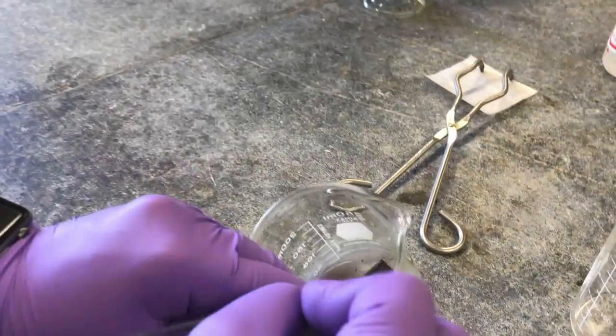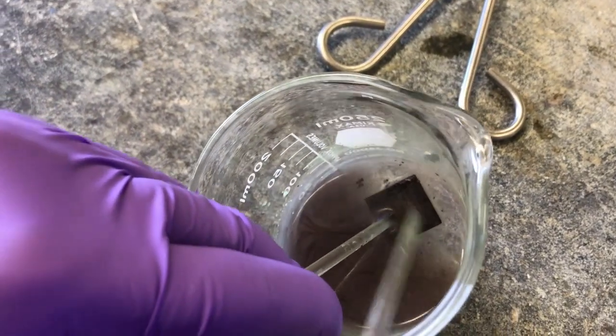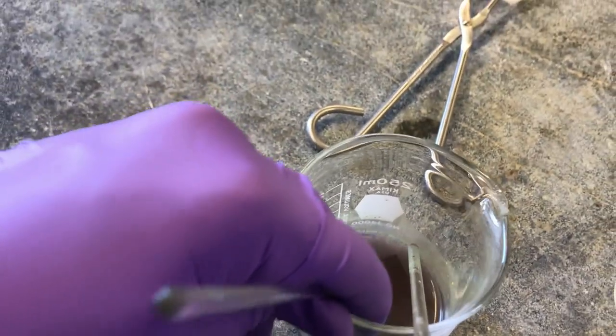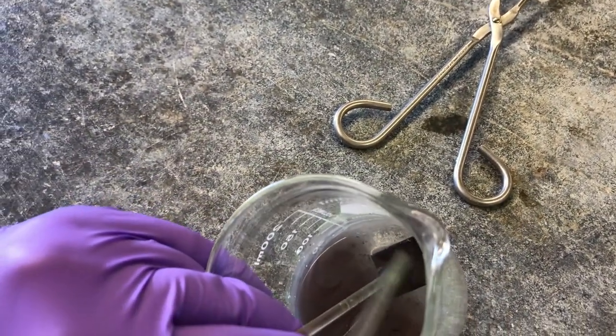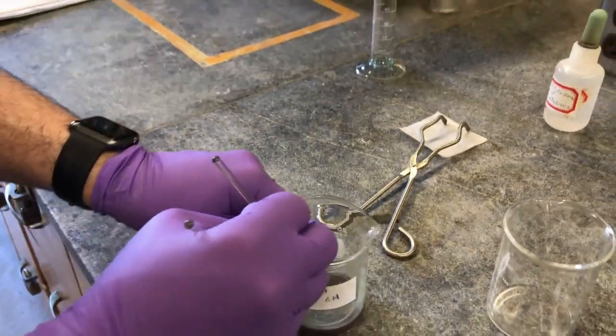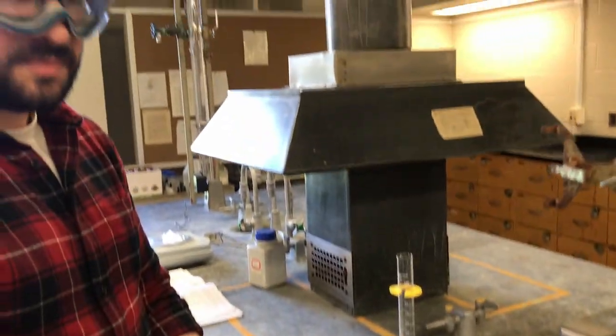You can see that when we scratch the zinc piece and we put it underneath the liquid and let it sit for a little bit and we bring it back up, we still see some scratches. So that means that the zinc surface is no longer reacting with the copper chloride solution and the reaction has gone to completion.